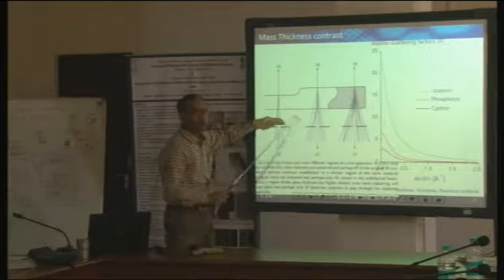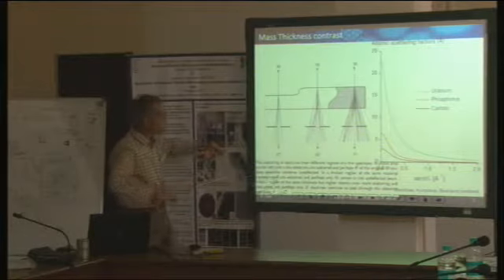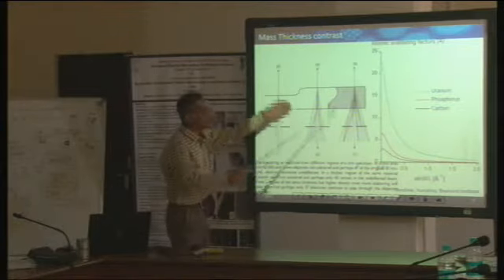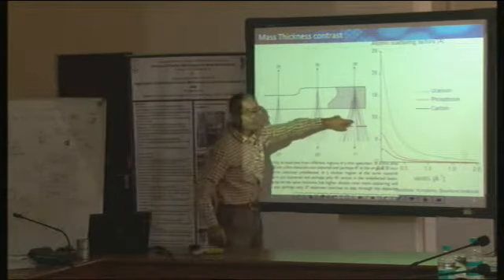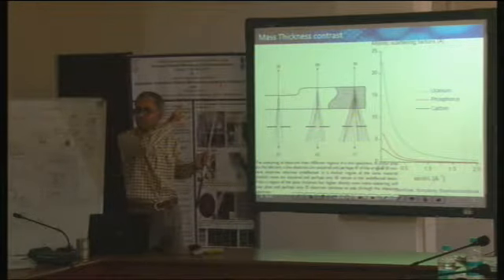When I put an objective aperture, all this big parallel direction would be concentrated into one spot, the first diffracted spot somewhere here. The one which went straight would form a spot here, and the one which went in that direction would form somewhere here. We saw that earlier many times, isn't it?